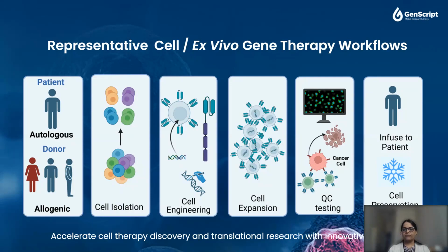The cell therapy manufacturing process is continuously refined to increase purity, potency, stability, reproducibility, and batch size, while developers also try to cut down on time and cost.